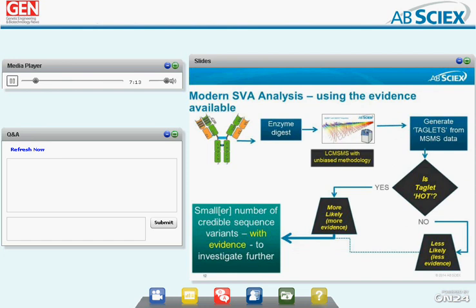So as we advanced further along, the better way of doing it was then doing the acquisition without any preconception. And the way in which it can be done today is by generating taglets, and you look at the taglets and decide if they're hot or not. Now, of course, this is not really a disco term. It refers to whether that taglet has a lot of information associated with it or whether there is less information associated with that taglet.